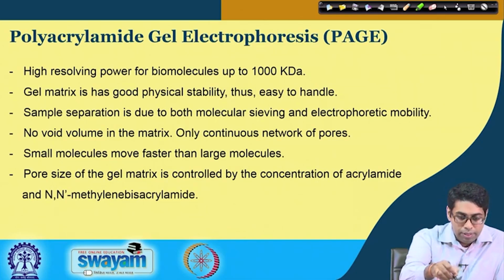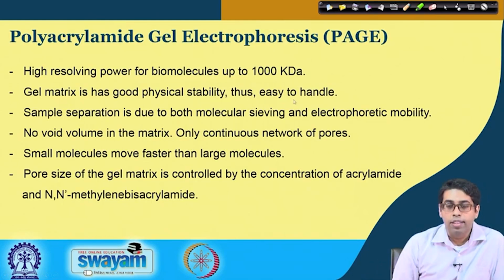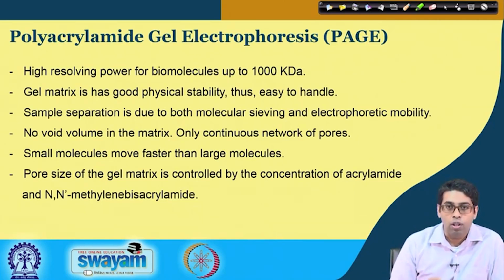So, some of the physical qualities of PAGE gel are listed here. One is that it has very good physical stability and thus is easy to handle. It means that after running a gel, you will have to take the gel out from the glass plates, you will have to stain it. So, a lot of handling is required. If the gel matrix breaks easily, then it becomes very inconvenient. PAGE, even though a very thin gel is used, has a very good physical stability, which means that it can be easily handled without damaging the gel.